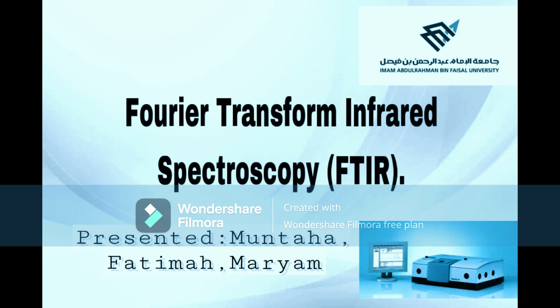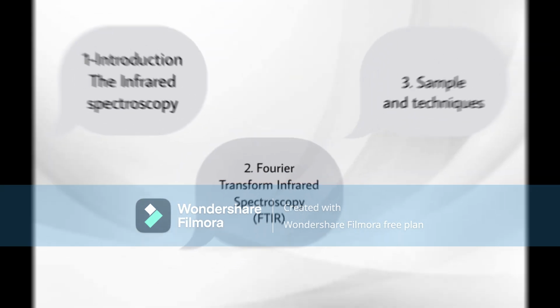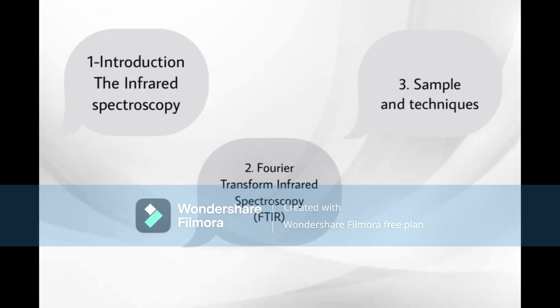This video will be divided into three sections: introduction to infrared spectroscopy, Fourier transform infrared spectroscopy FTIR, and sample and techniques. We hope by the end of this video you will have a better understanding of FTIR, when to use them and how.